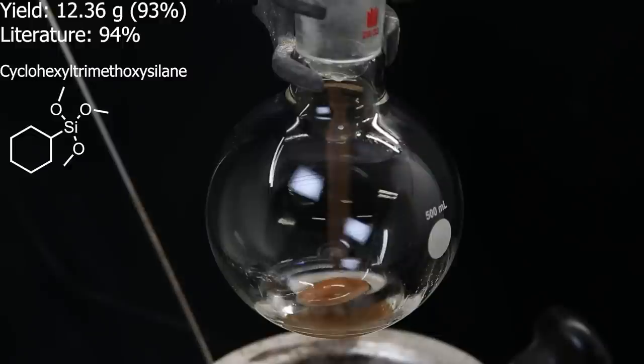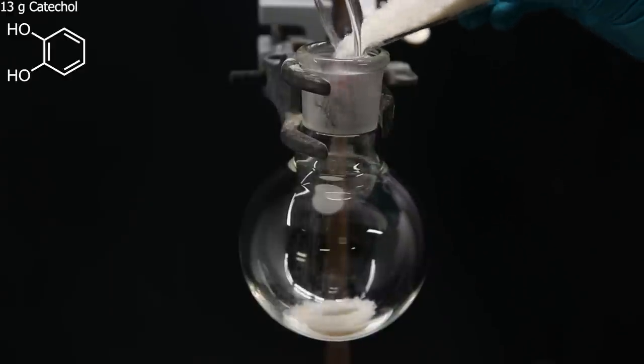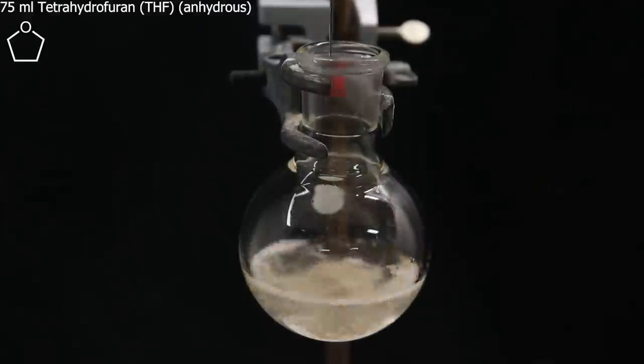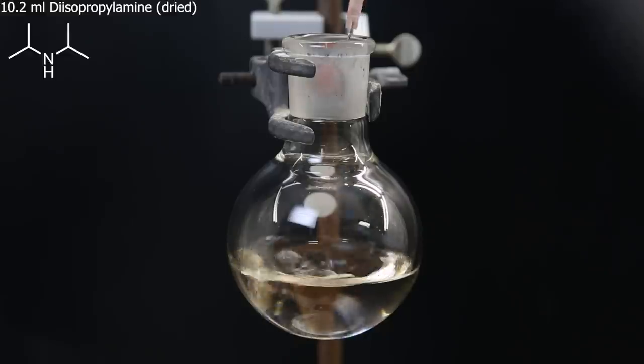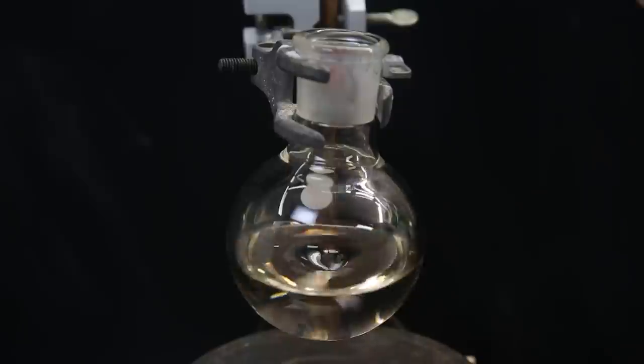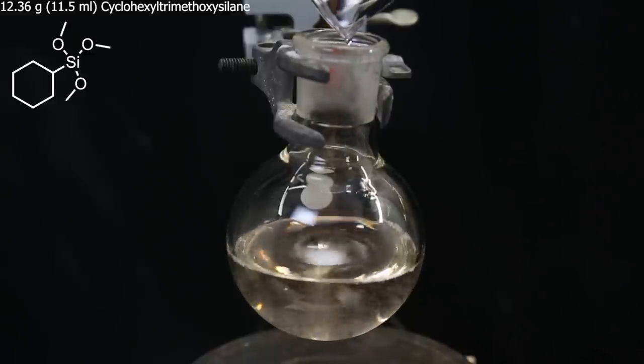Anyhow, now with this product, we can move on to the next reaction. So I set up a new flask and drop in a stir bar, and then add in 13 grams of catechol as the first reagent, and dissolve it in 75 mL of THF. To this solution, I add 10.2 mL of diisopropylamine as a second reagent. Then on top of that, I add in all of the cyclohexyltrimethoxysilane I just made.